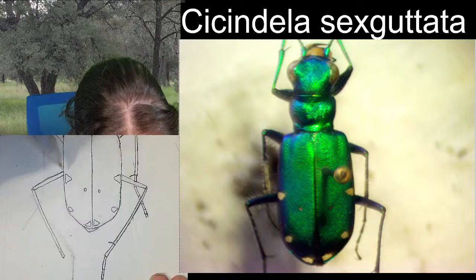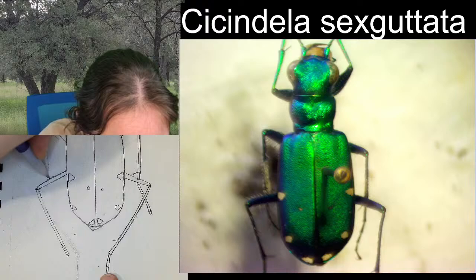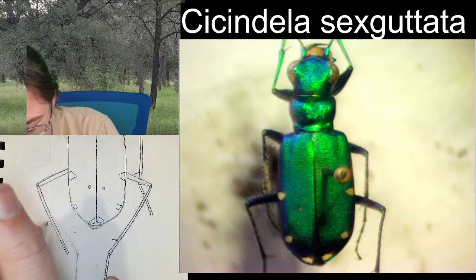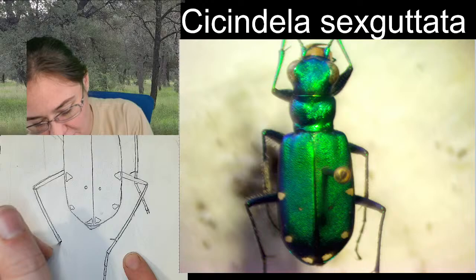Aren't going to be exactly parallel with each other, but as long as they are approximately the same length, that's what matters. My specimen might be walking a little bit. I can see that I do like the angle of my right leg just a little bit better, but I think that these will both be fairly equivalent.